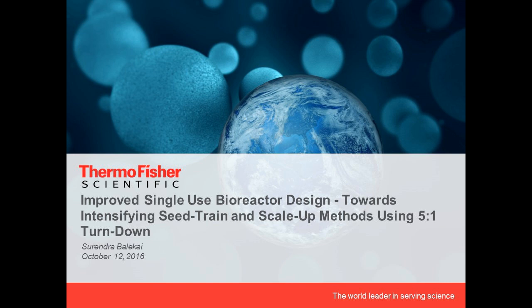Many of you from the industry are definitely well knowledgeable about the bioreactor process and design aspects. In this session, I'm going to cover some of the critical aspects, especially when we talk about higher turn-down ratio and its impact on the process itself.